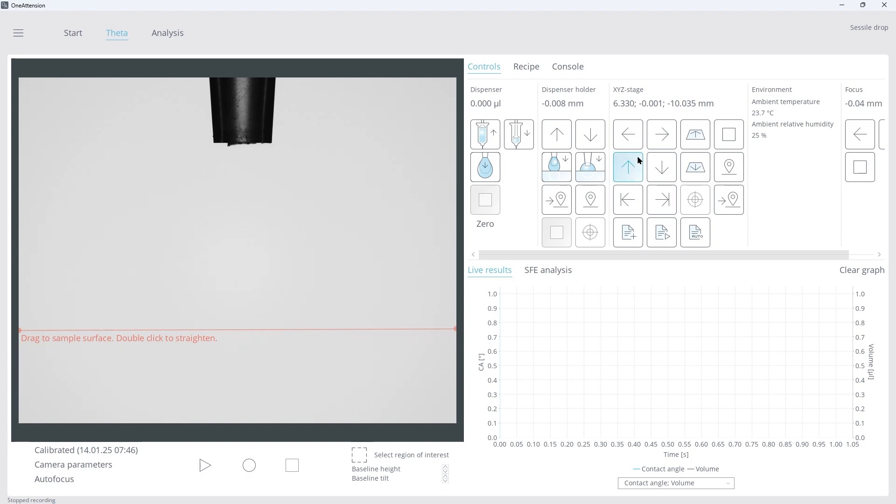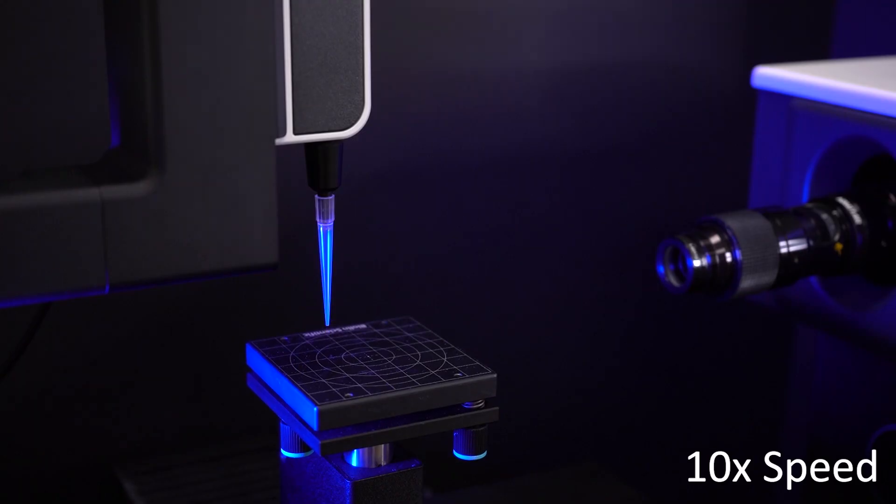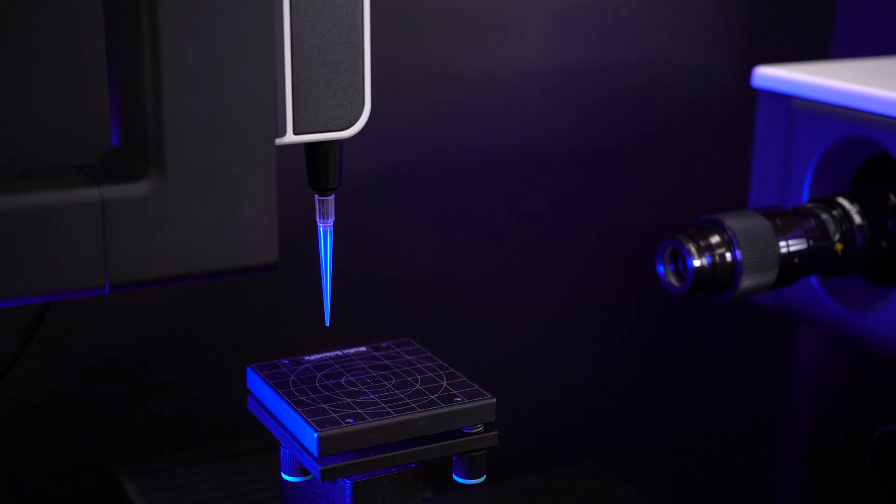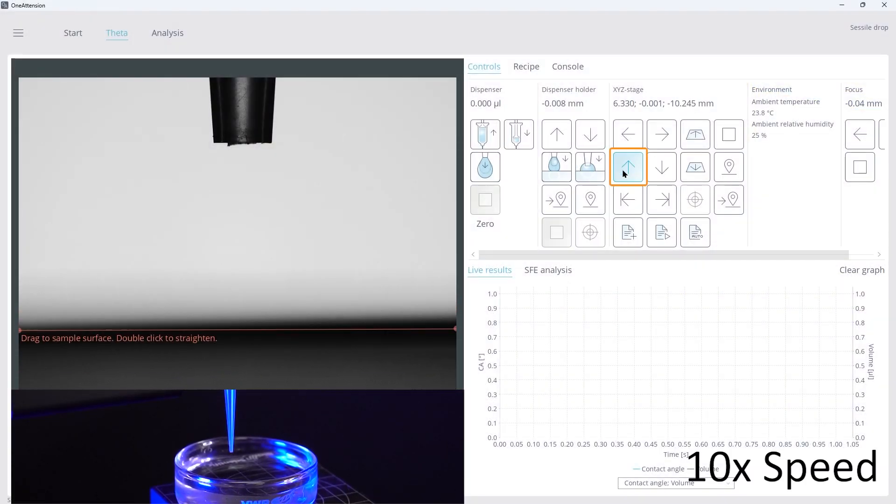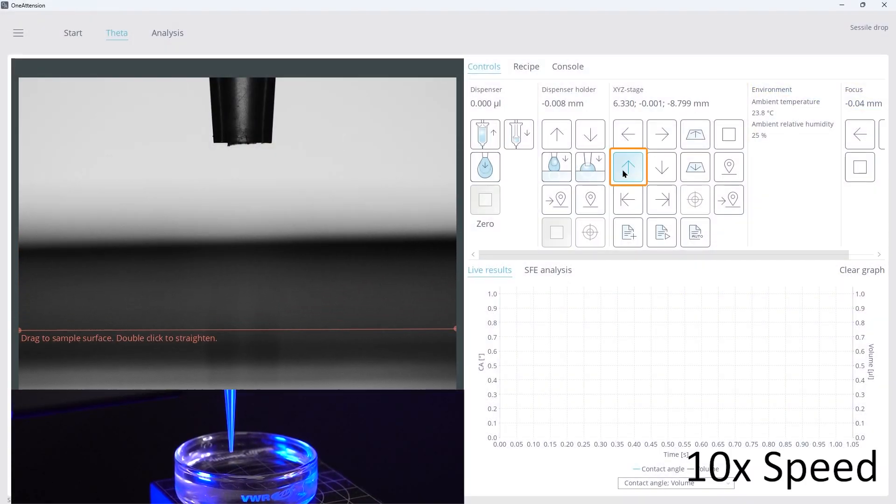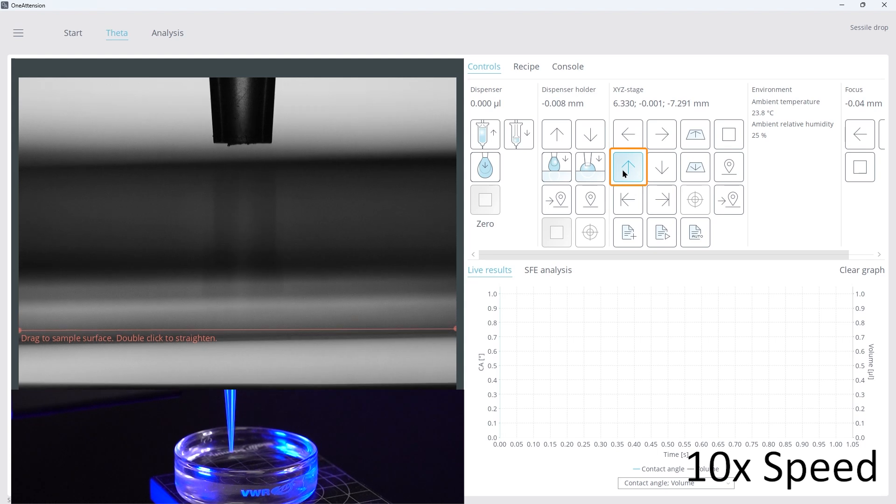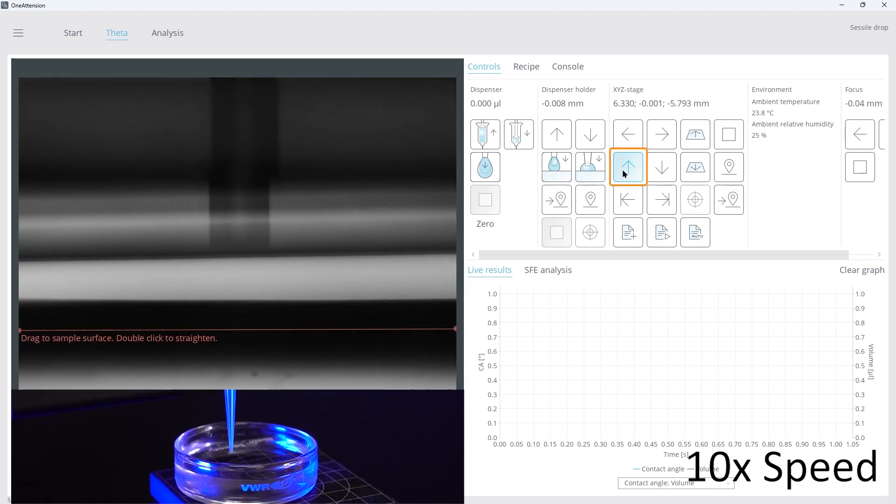Use the down arrow to lower the stage so we can place our sample vessel. Now, use the up arrow to bring the stage back up to submerge the pipette tip.